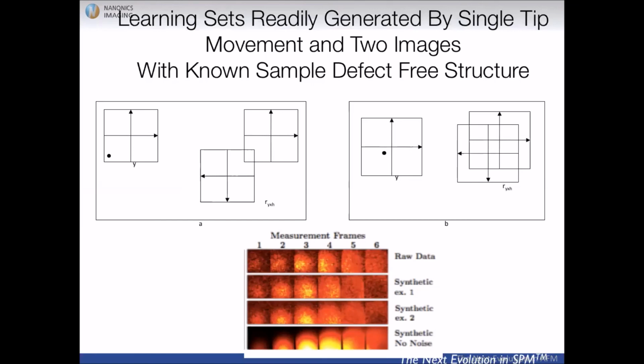You could also use structured illumination, and then you'd even get more resolution. So there are methods to deal with it, but they're complicated methods.